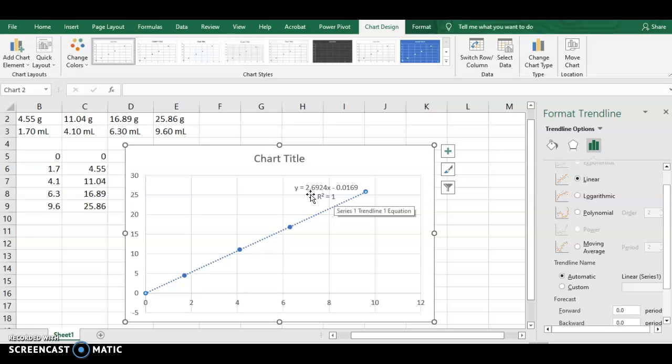And so that is what you will probably need for something. But this chart is what you need. That graph is what you need to either take a screenshot of or save to be able to upload onto the LabFlow for this particular lab.